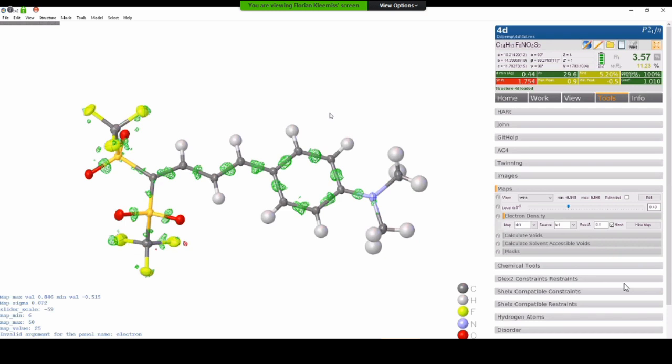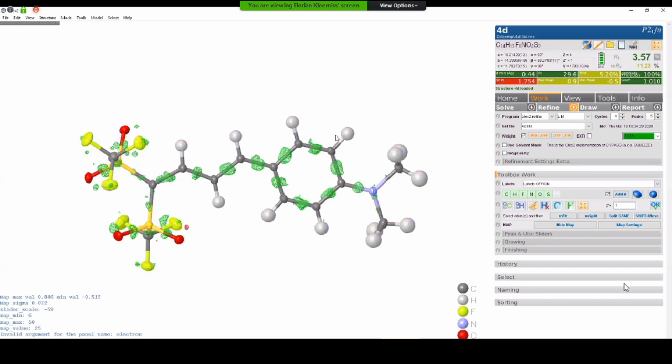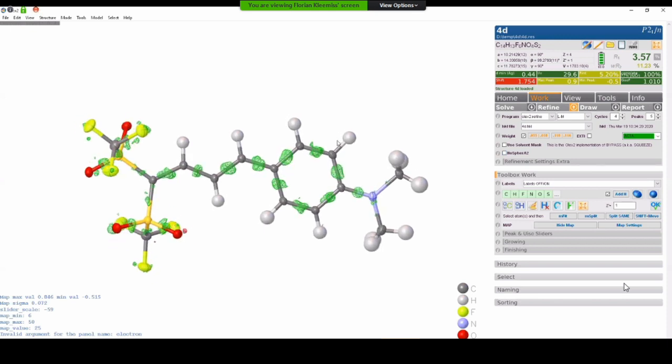In principle, NoSpherA2 is intended to not only be for people who want to do Hirshfeld atom refinement, but we might open this format. It's a standardized format. There's an arXiv article about the format that we are using to get the asphericity into Olex2. So in principle, this file format is open to use any kind of asphericity, but so far I've focused on implementing Hirshfeld atom refinement since I am a PhD student of Simon Grabowski at the University of Bern. I know that one quite well.